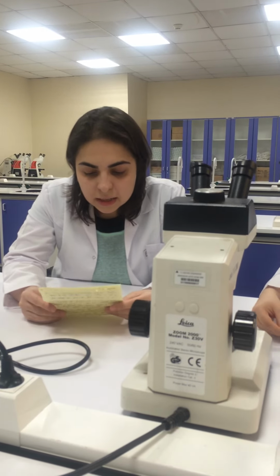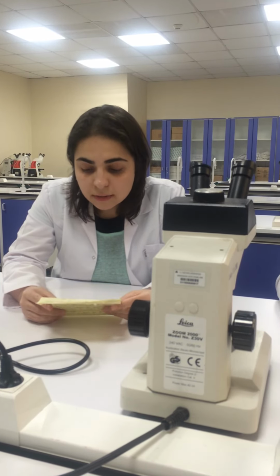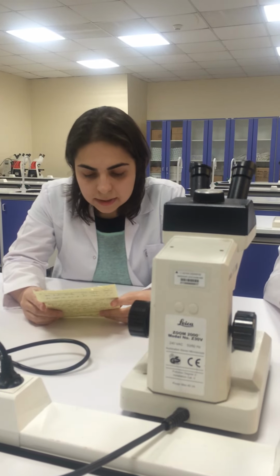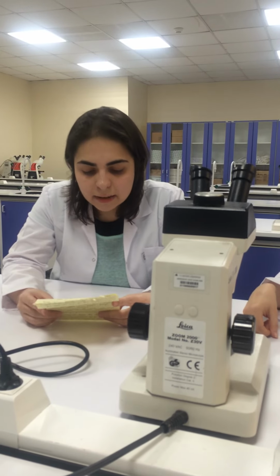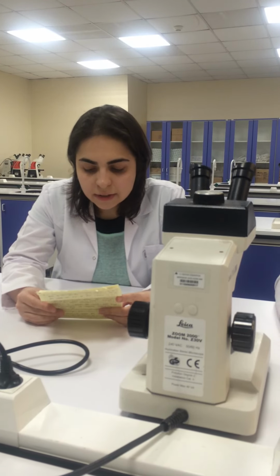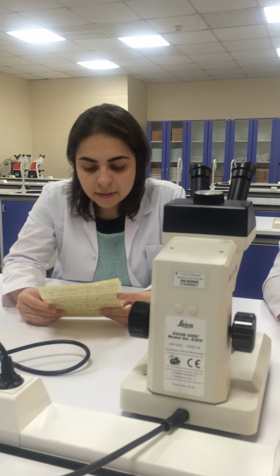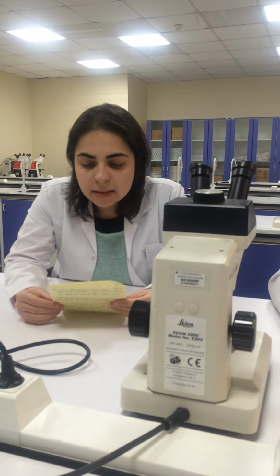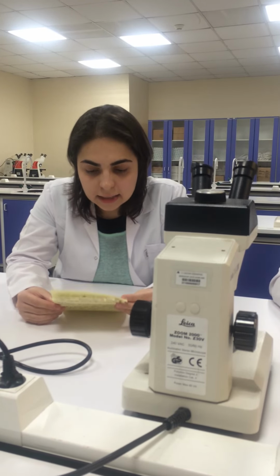Remaining muscle is separated from adipose tissue by using forceps and scissors to avoid muscle contamination in sample. Fat is cut into squares, then pieces are placed in new sterilized beaker containing serum-free DMEM. One piece of fat is placed onto customized slice holder with carbon steel slicer, with skin layer on top and fat layer on bottom. Then tissue is sliced into 1 mm thick pieces, avoiding slicing the skin.